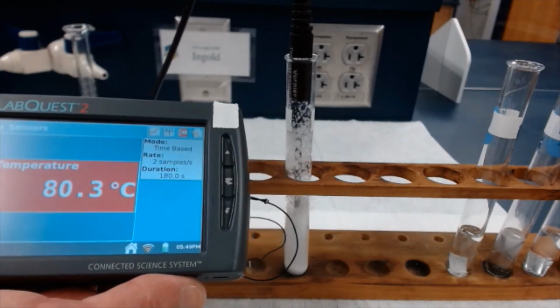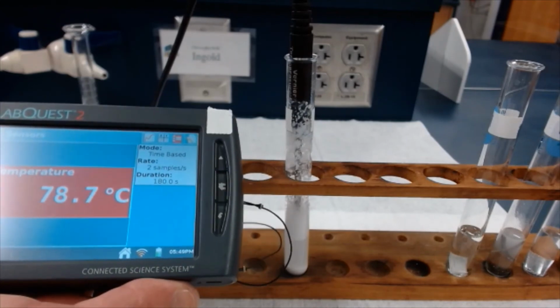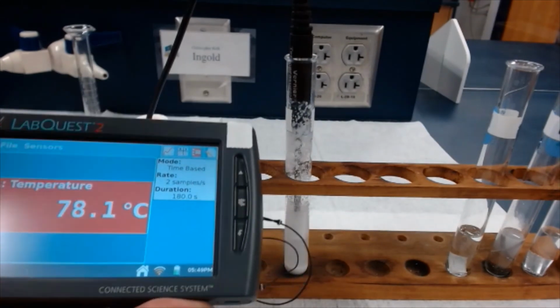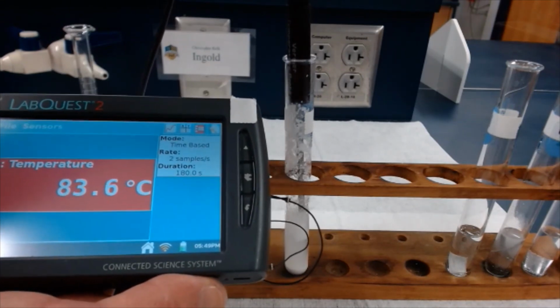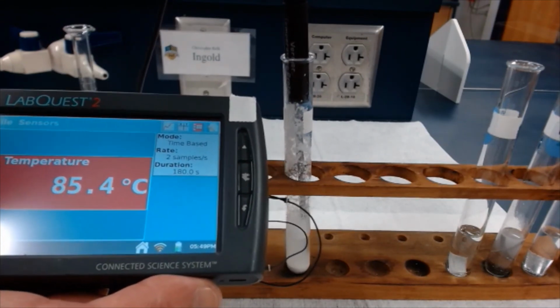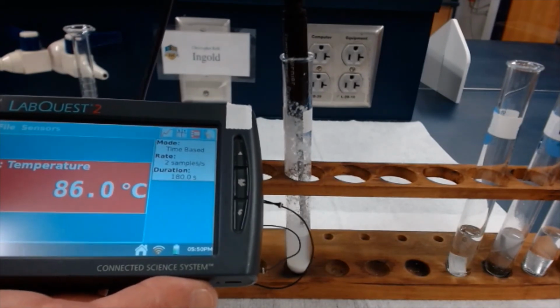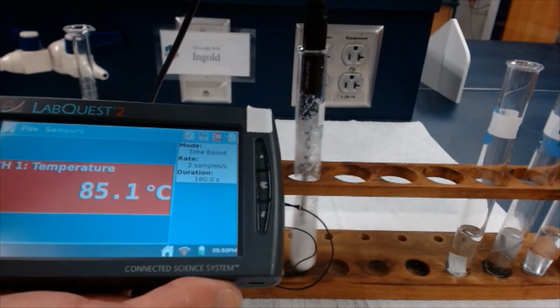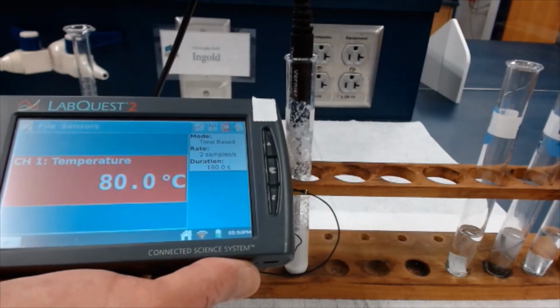Now the reaction's slowing down, so the temperature might be going down a little. And let's let it stabilize there. Let me hold the thermometer. Now we can probably say something like, I'll stop moving it, and then we'll let it hopefully settle down.